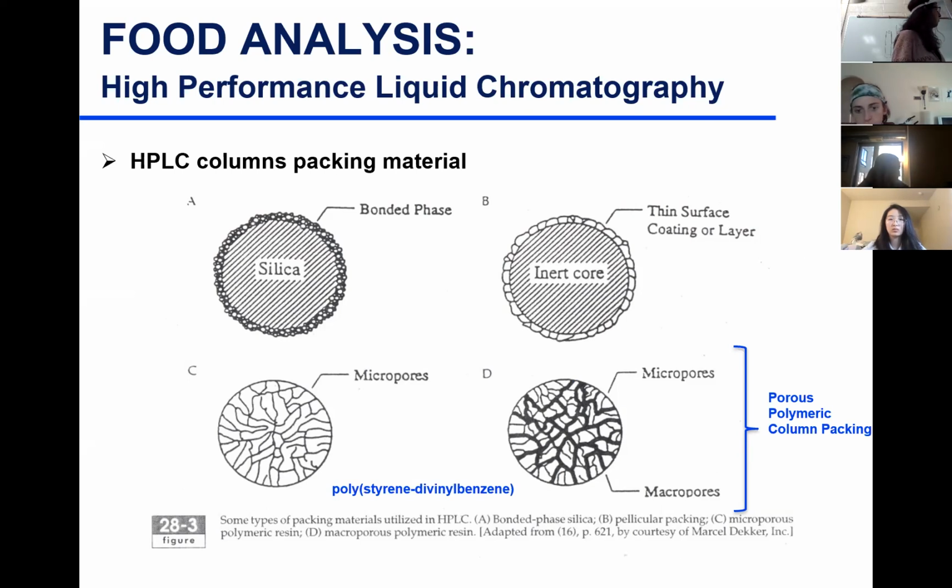The other one is for smaller molecules, where you have a highly interlinked matrix with smaller spaces in between, and that's for smaller molecules. These two setups are used quite a bit in ion exchange chromatography and for separating components with charge. This is a very common form of stationary phase. And again, depending on the size, we are separating larger versus smaller size components.